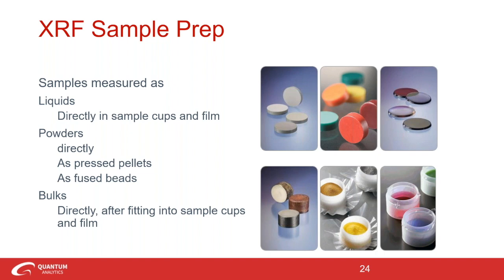So another thing I'll say about liquids and even some powders, if you're going to run them as loose powders, you should pay attention to the films that you use, because you want to be able to use the right films for the right material. And if you're not familiar with what films you should be using, there are a number of resources available to you that can help you, especially there's a number of companies that make these types of films, and they have their own guidelines that tell you which ones are good for which type of samples you're going to be analyzing, the thicknesses that you might need to use, and so on.